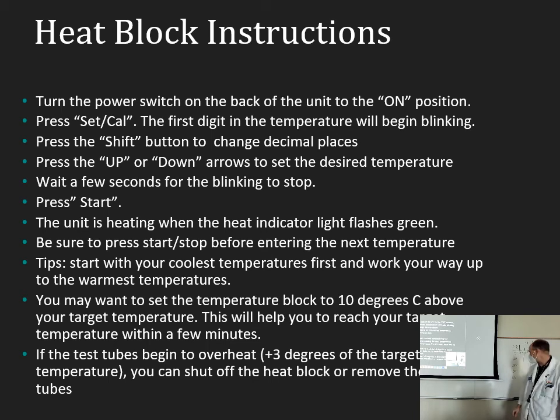And the good news is, let's say you wanted to do 30 and you're trying to get it at the right temperature and you shoot past 30, you get to like 38 and you're like, crap. Well, then you can go ahead and use it for 60 and you can wait for it to cool down when you're done. So if you start cool and work up, it's better.